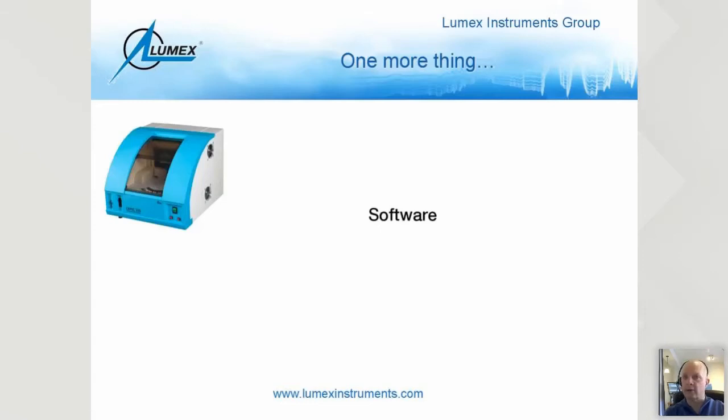Of course, if you buy any commercial system, it'll always come with a software. Our software is called LFORun, and there's several things that I like about that software. The first thing is that it's very easy to use, and I'll actually demonstrate that to you in a few minutes. You'll see how easy it is to use. In a couple of clicks, you've done so much work. Compared to other softwares that I've worked with, it's fairly simple to set this software up and start getting not only qualitative data, but quantitative data as well.